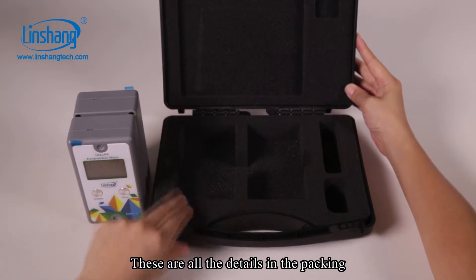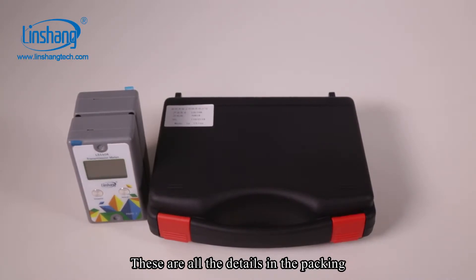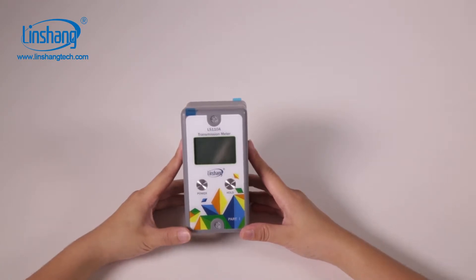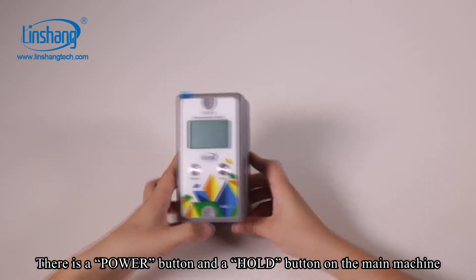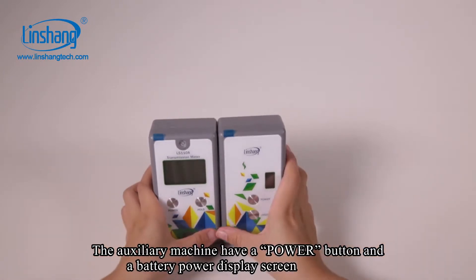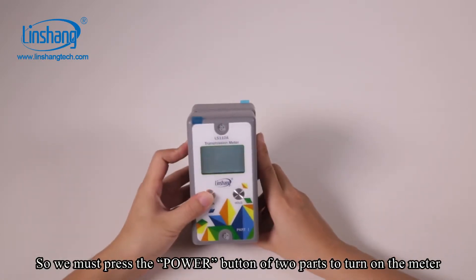These are all the details in the packaging. Now let's demonstrate the operation of the LS110A. There is a power button and a hold button on the main machine. The meter consists of two parts. The auxiliary machine has a power button and a battery power display screen. We must press the power button of both parts to turn on the meter.